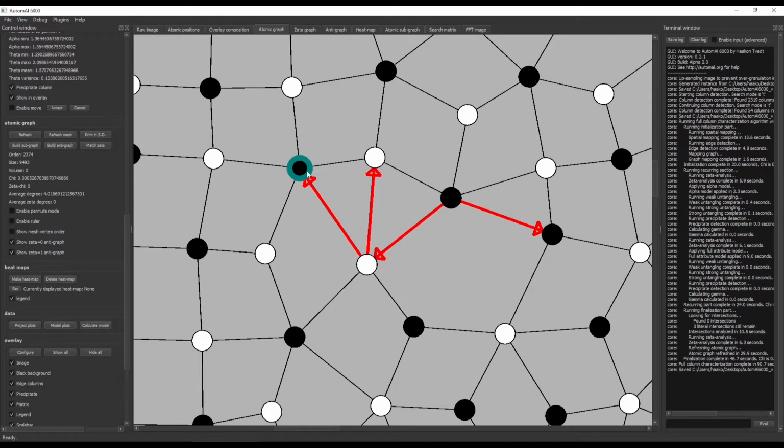This one is pointing to this one, but this is not pointing back, because if it were pointing back, then this arc would be symmetric and the line would be black. The problem is that this one has 4 extending arcs, but it should have 5. So this is mislabeled as aluminium when in fact it is magnesium.